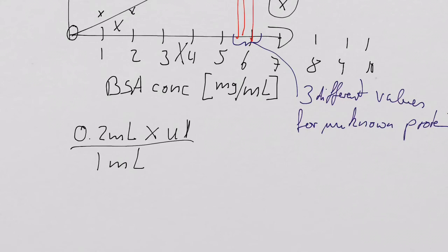Yeah? And this gives us, say, something like 5.7 milligram per milliliter. Does that make sense so far?